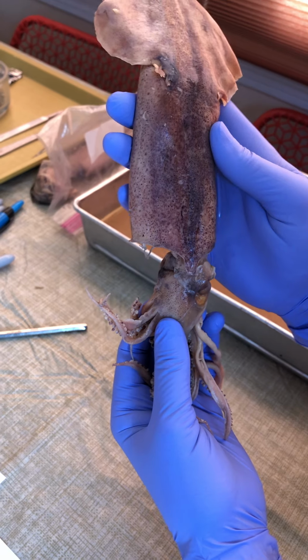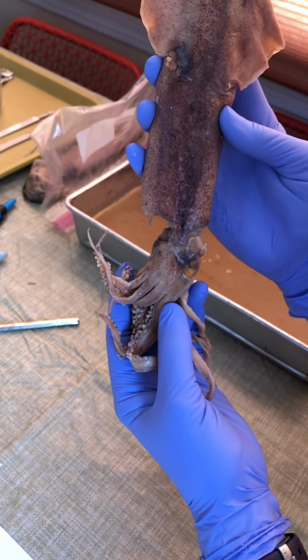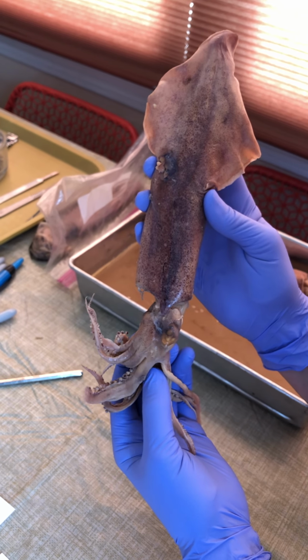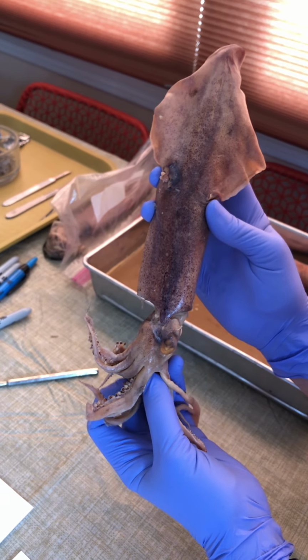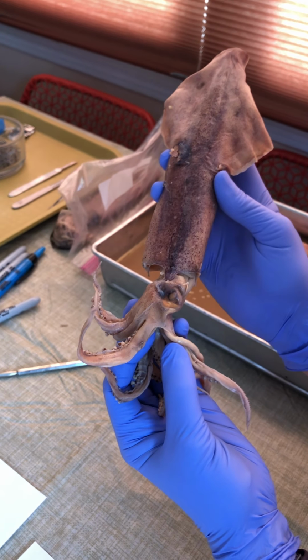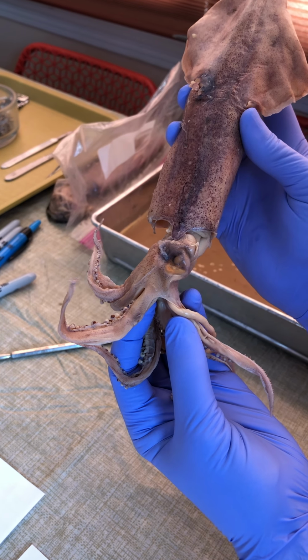Now, the deal is that the orientation of these body axes is so counterintuitive, it is ridiculous. By definition, the mouth is generally at the anterior end of the animal, right?